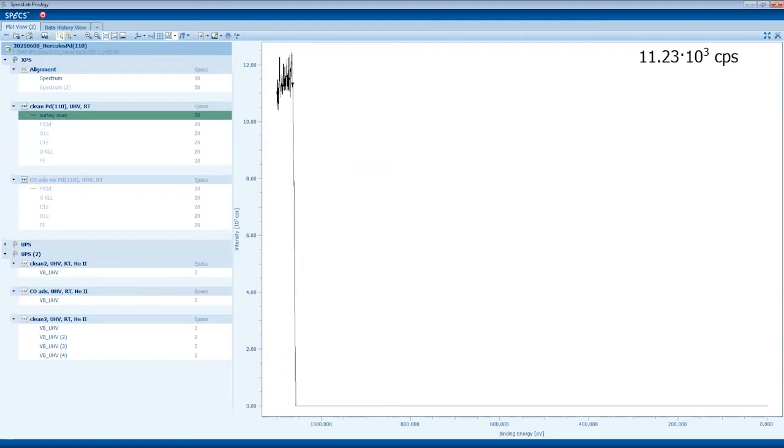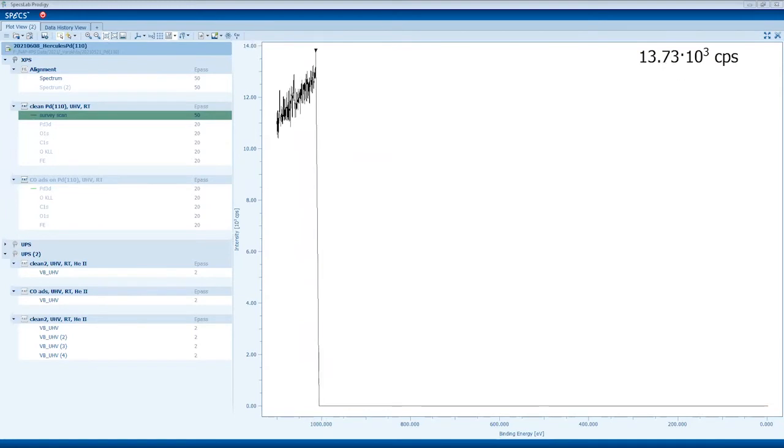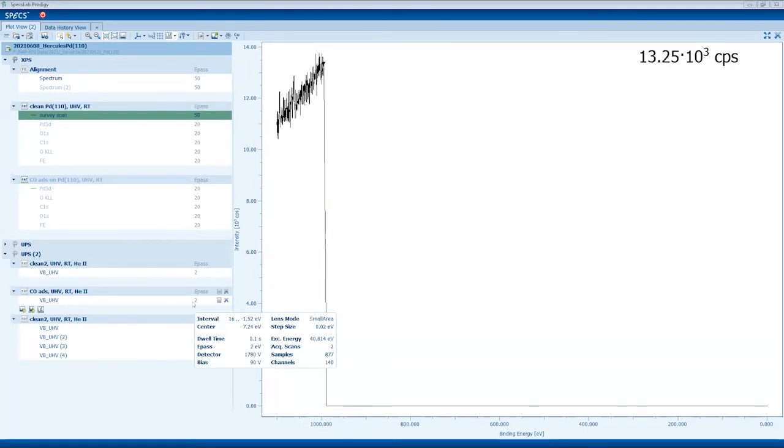First we move a bit with the beam. Then we also check the potentials on this electrostatic lens, which keeps the electrons in the analyzer, in the differential pumping part. The maximum current from the analyzer is regulated by the software, or you can adjust the lenses. You can switch back to this screen.